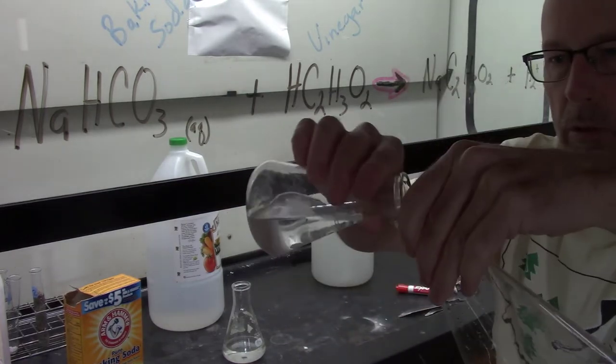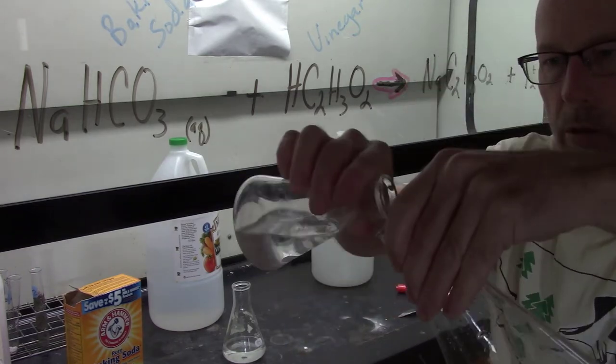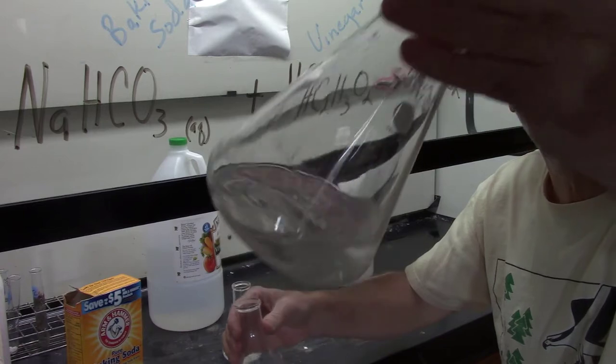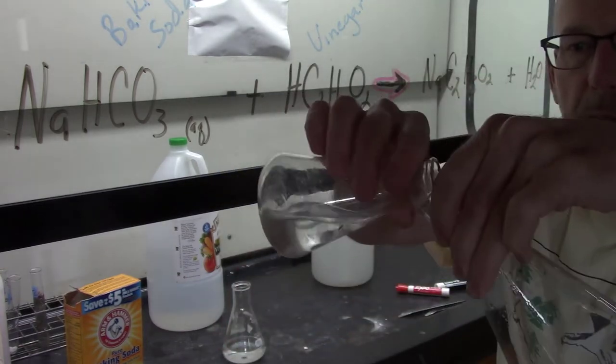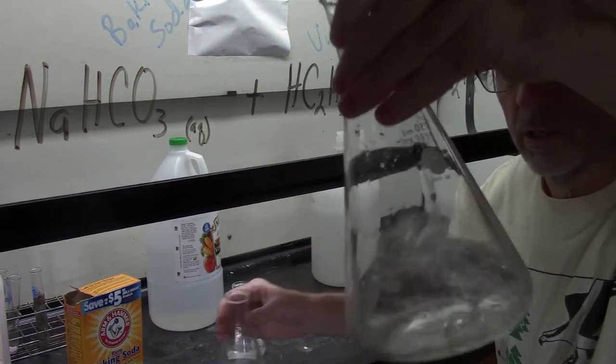Bubbles. Let me add some more. Some more. Oops, and the bubbles stop. No matter how much more baking soda, sodium bicarbonate, that I add, the reaction just doesn't go anywhere.